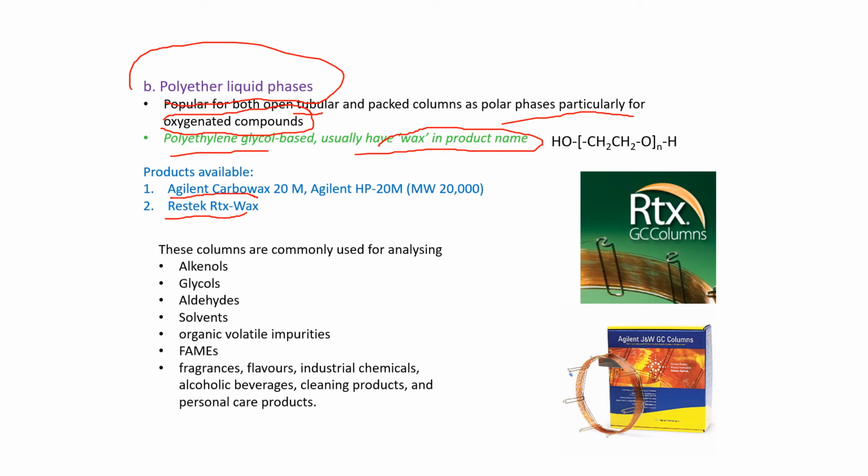Okay, these columns are commonly used for analyzing glycols. Also, very important for you guys when you work later: fragrance, personal care products, cleaning products, and industrial chemicals.